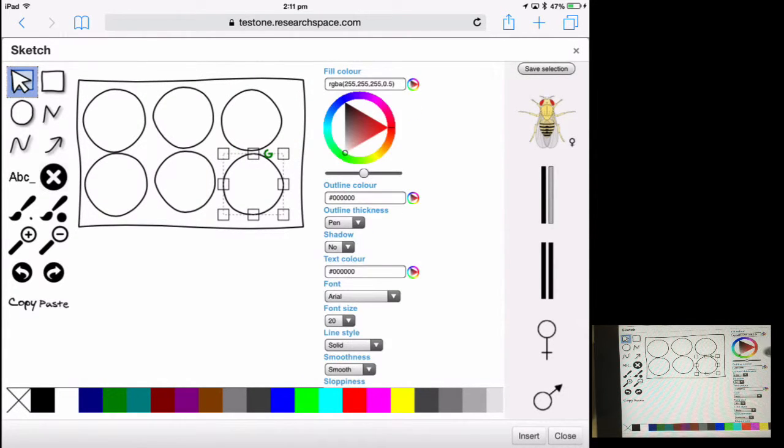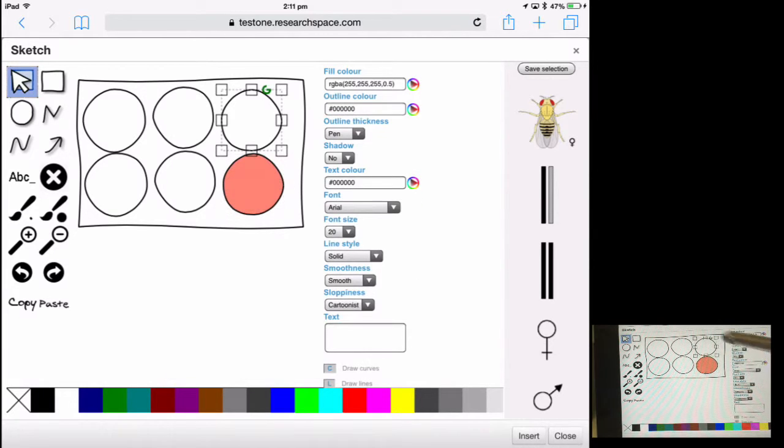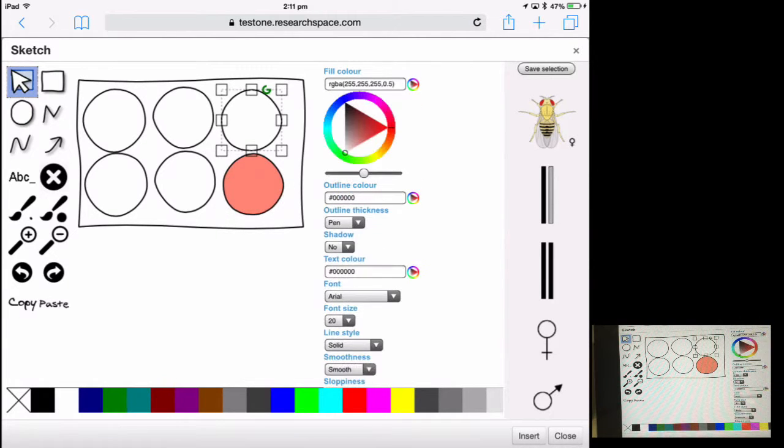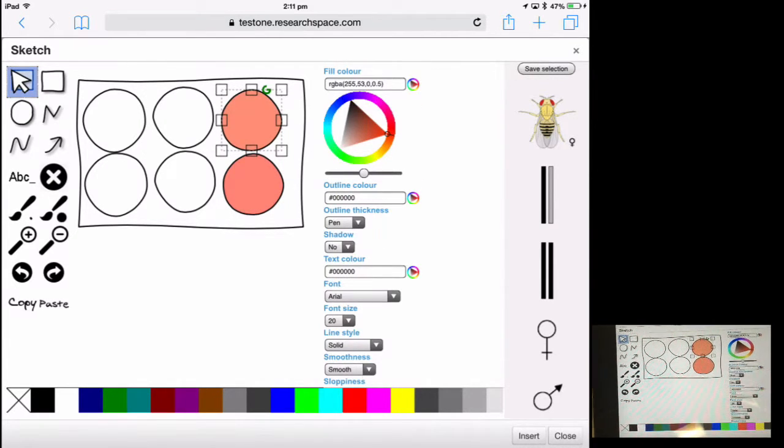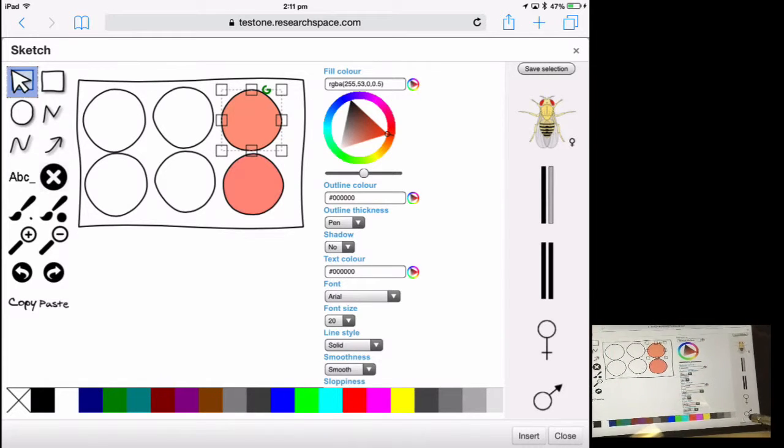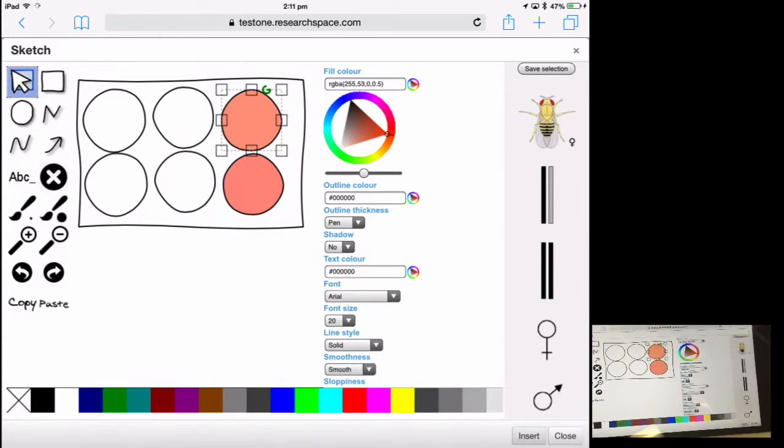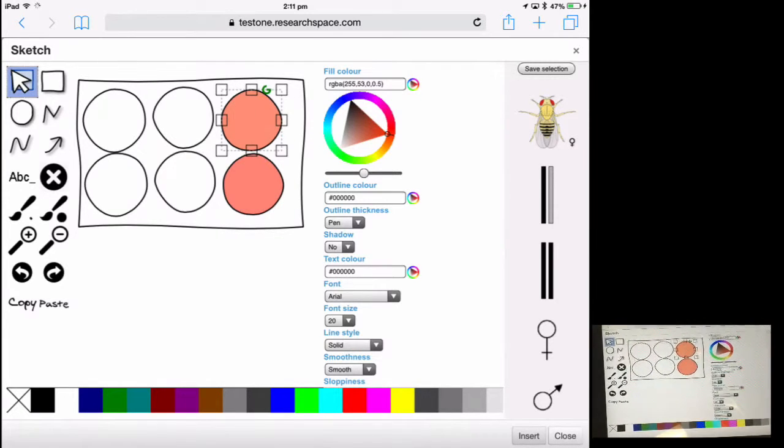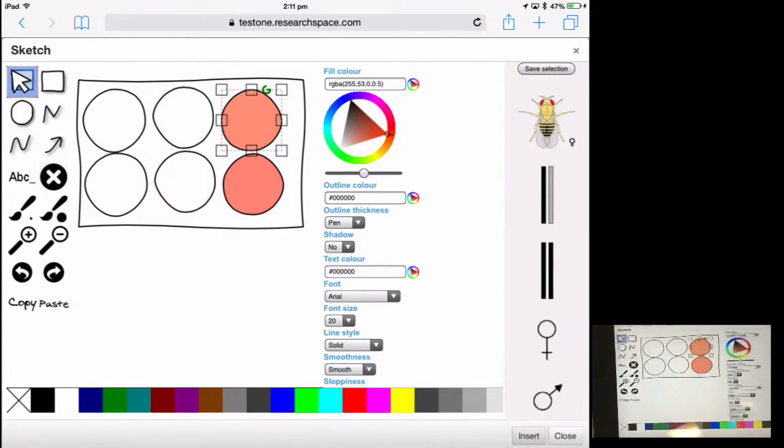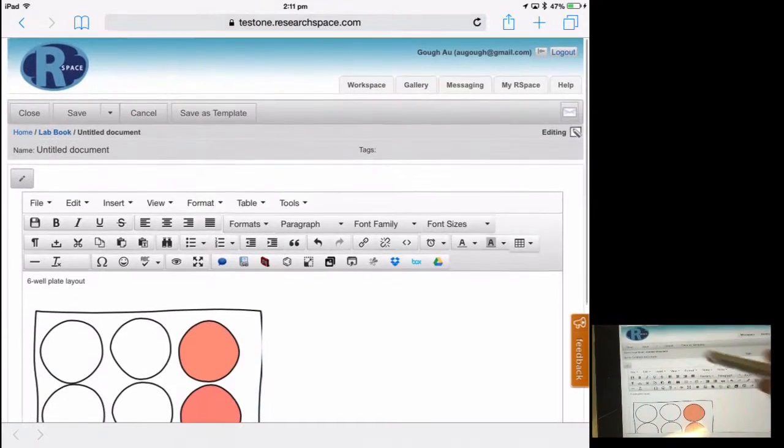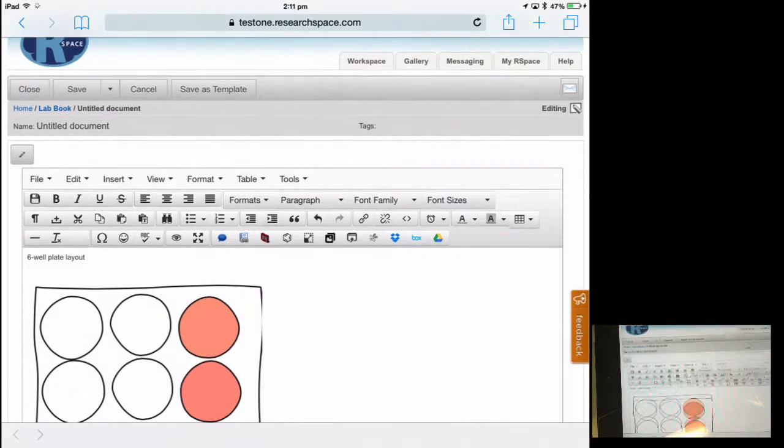You can also adjust the fill color just by clicking on an item and tweaking the color select triangle. Once you're done you can click insert sketch and that image will be inserted into the lab notebook.